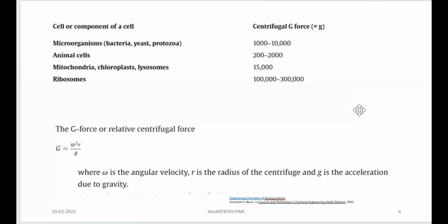The central shaft is the central axis of the instrument. When you keep the tube into an individual tube socket, it is at a particular angle from the central shaft. So your particle is rotating at a particular angle. It is not straight or parallel to the central axis of the instrument.